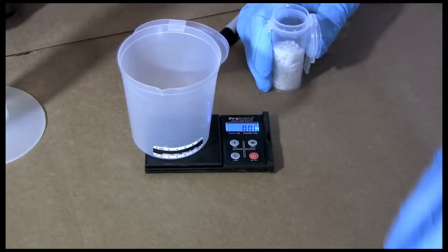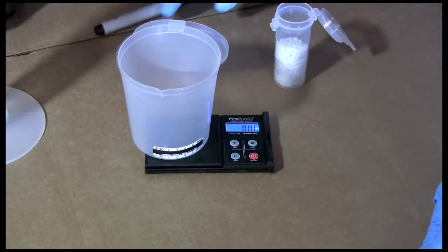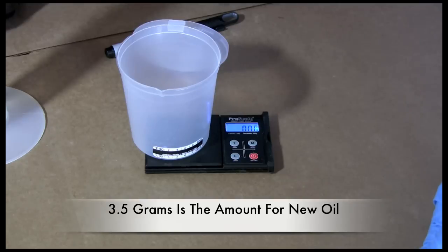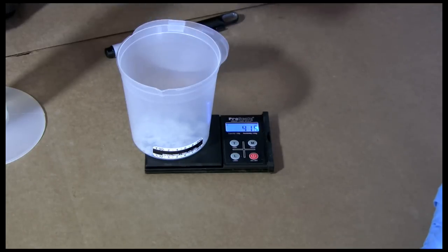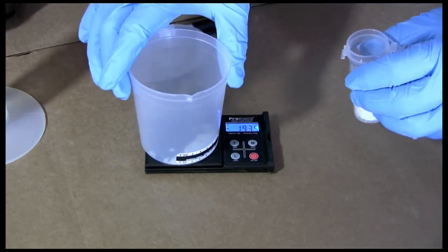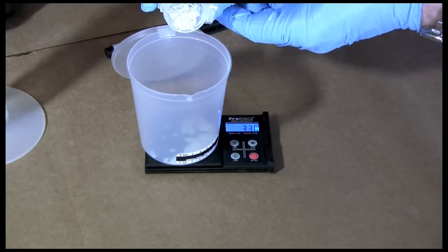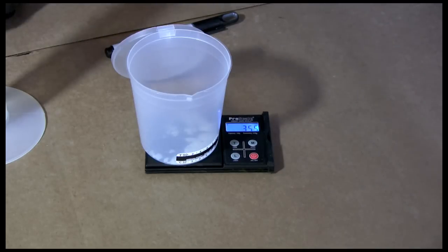Step number three is to weigh out the catalyst. We've taken out our scale, put our container on top of it, and used the tare function on our scale to zero it out. For a 500 milliliter batch, we're going to use 3.5 grams of potassium hydroxide — exactly half of what you'd use in a liter batch. Very carefully put this into the cup until we get 3.5 grams. We're at 3.55, just a little bit over — it's not a problem.